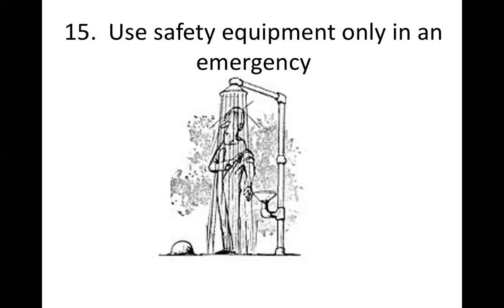And sometimes the sink is too small. If the area of your body that was exposed to the chemical or to the acid is big, you have to use the shower. So the shower is there not because the teacher wants to take a bath, but because it's a safety equipment. So you flush out the acid with enough water, and then after that, you go to a clinic or a hospital so that they can treat the burn. But before that, the first aid when it comes to chemical spills is always to flush it out with lots and lots of water. So we only use the shower if there is an emergency.